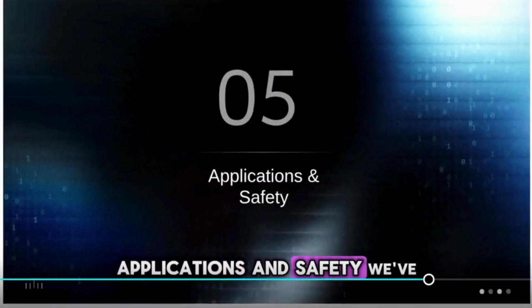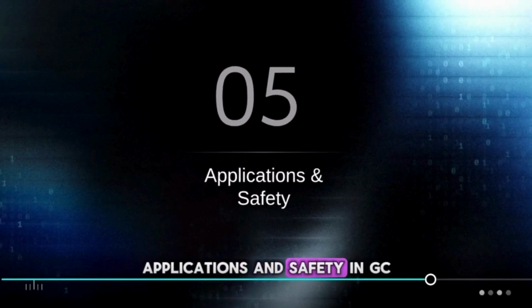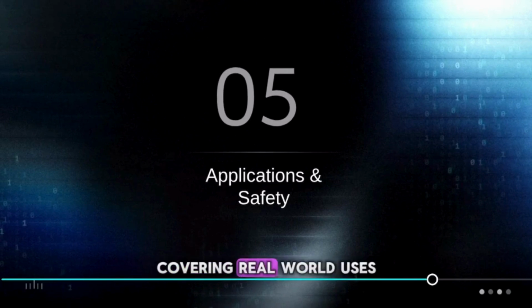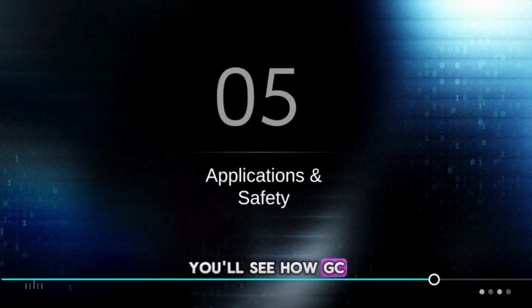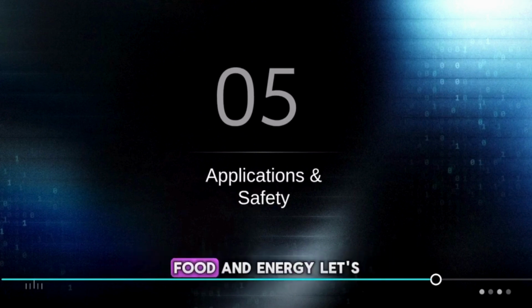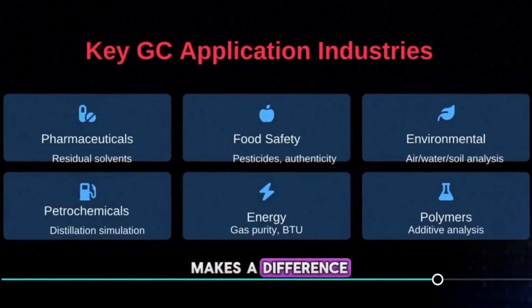Applications and safety. We've now reached the final chapter, applications and safety in GC. This is where theory meets practice, covering real-world uses across multiple industries. You'll see how GC ensures quality, safety, and compliance across pharmaceuticals, food, and energy. Let's explore where GC truly makes a difference.